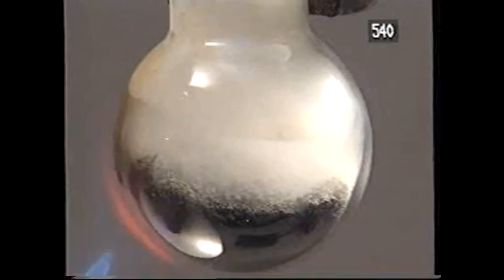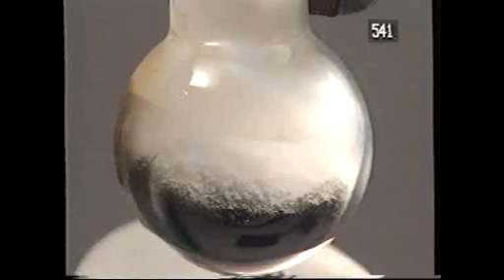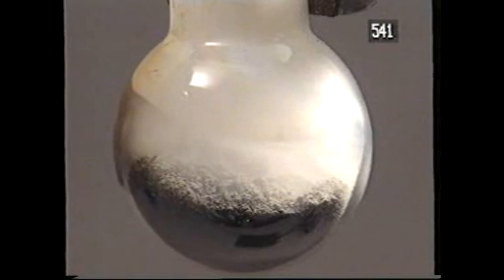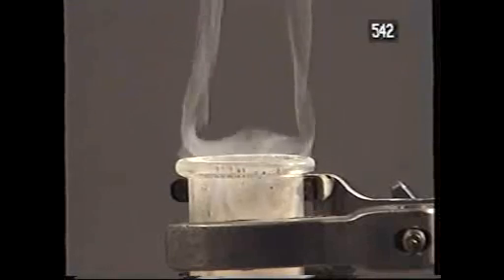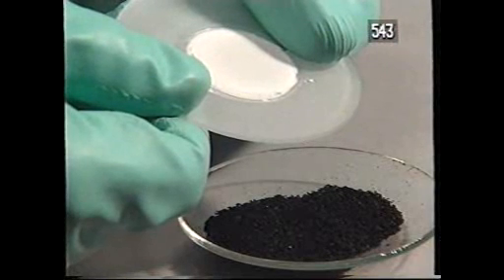That's ammonium chloride. It sublimes. That is, it changes straight from solid to vapour. Then, if the vapour finds a cold surface, it goes back to a solid. The ammonium chloride has sublimed up through the hot soot to the cooler surface. I'm steering the white ammonium chloride to the cooler top half of the flask. There's a little bit of tar lower down, but at the top a nice white solid. White ammonium chloride sublimed and separated from black soot.